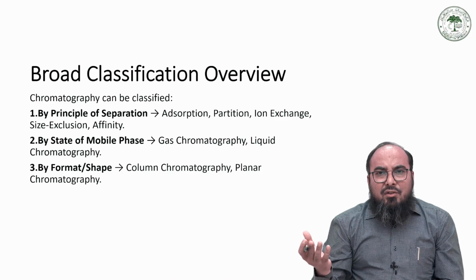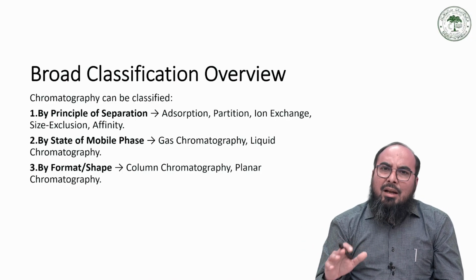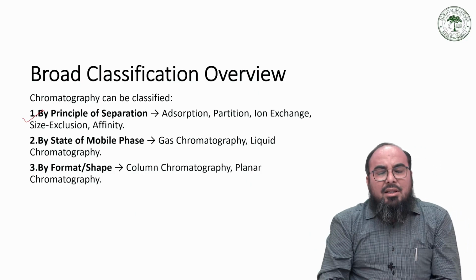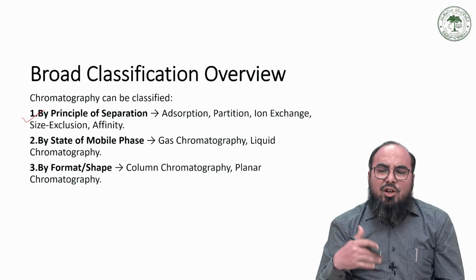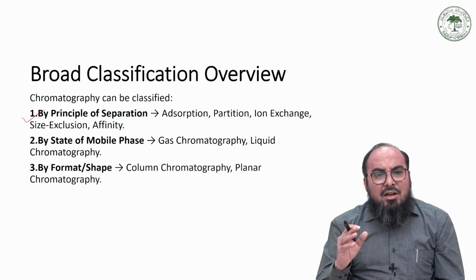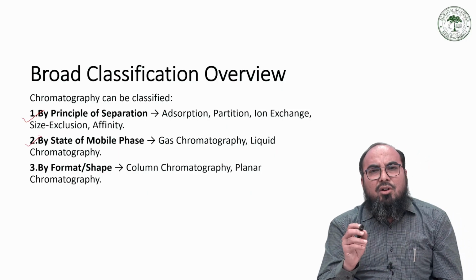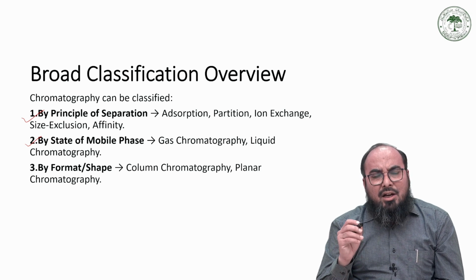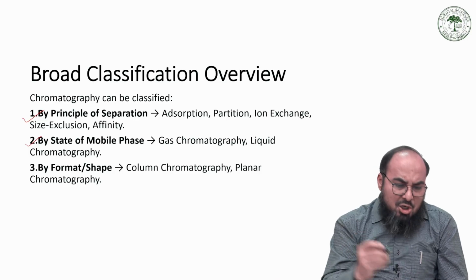So you can classify the chromatographic techniques in a number of ways. You can classify on the basis of the principle of separation, on the state of the mobile phase used, or on the basis of the format, the shape.